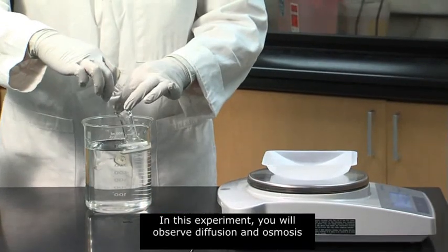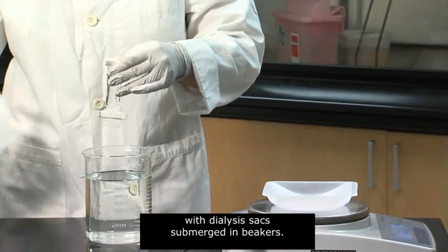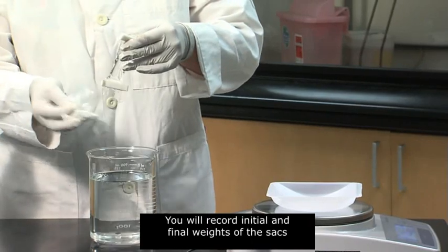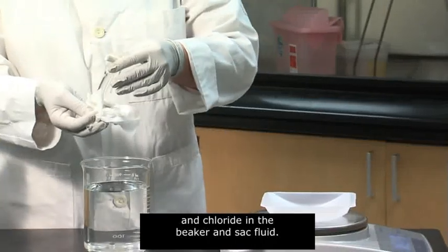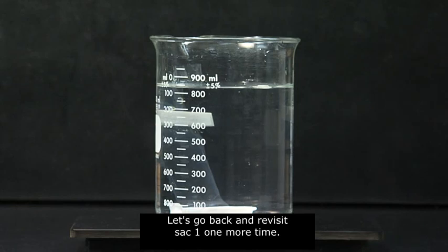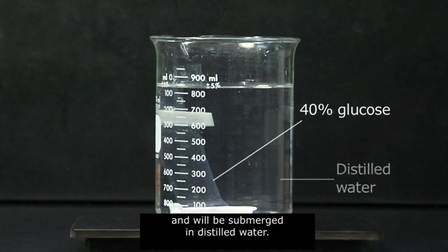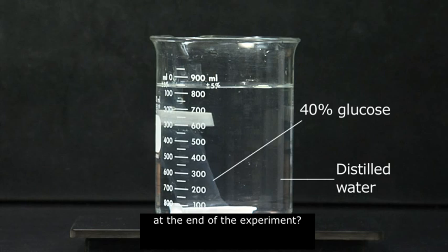In this experiment, you'll observe diffusion and osmosis with dialysis sacs submerged in beakers. You'll record initial and final weights of the sacs to determine weight change, and test for the presence of glucose and chloride in the beaker and sac fluid. Let's go back and revisit sac 1 one more time. Sac 1 contains 40% glucose and will be submerged in distilled water. Based on your knowledge of diffusion and osmosis, what will happen to the sac 1 beaker 1 combination at the end of the experiment? As you head into the lab, consider what your prediction would be.